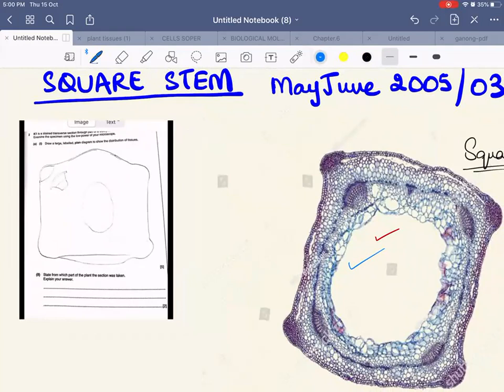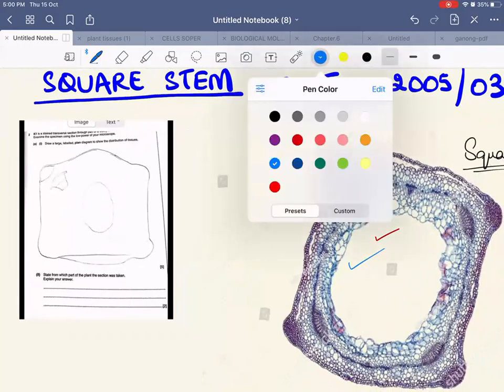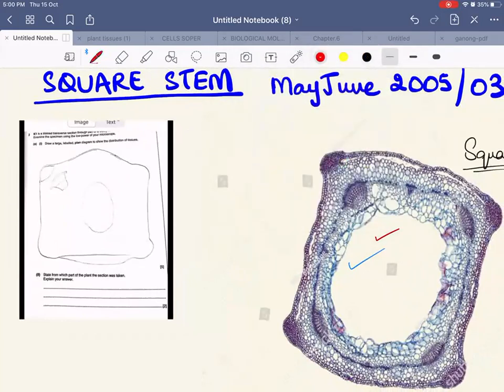This patch you can see. I have represented this patch. This one is a separate layer. These cells are not similar to the epidermis, so this means that these are some separate layers. So I have to show this layer on the plan diagram over here, which I have shown, right? Then I also have to show this layer, which is the vascular bundle.